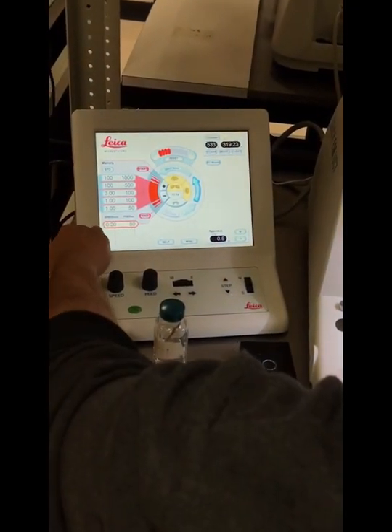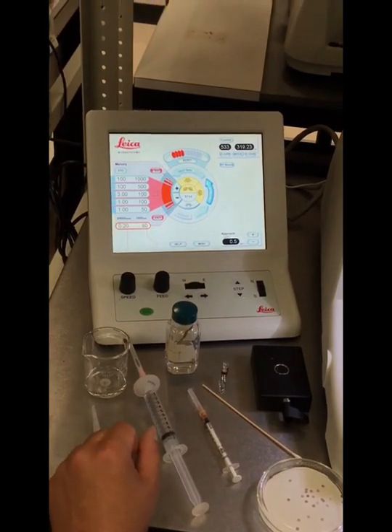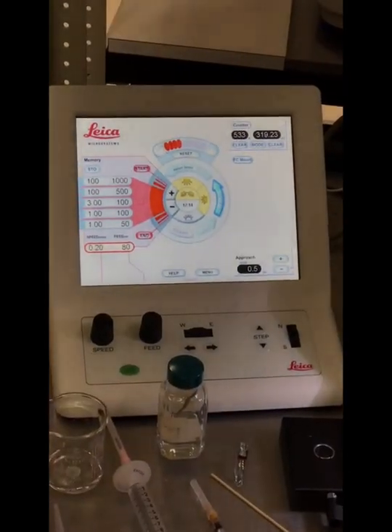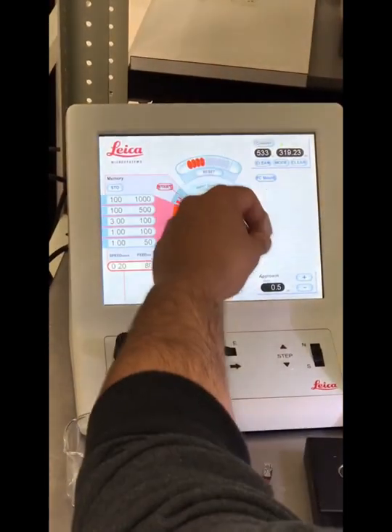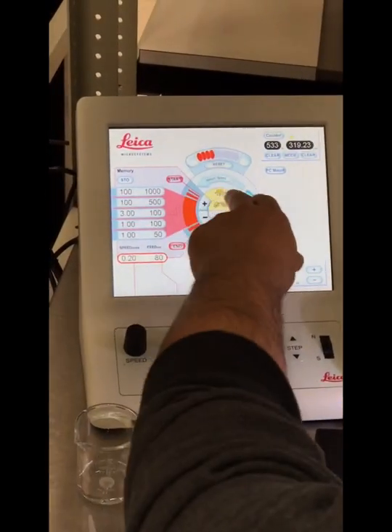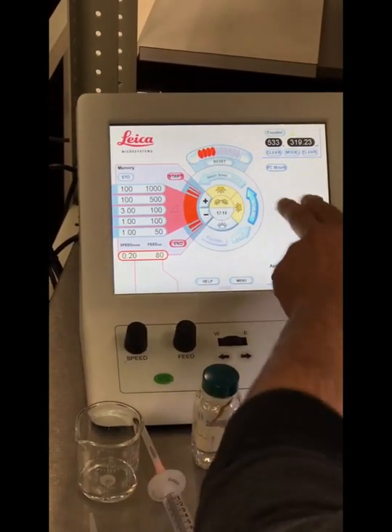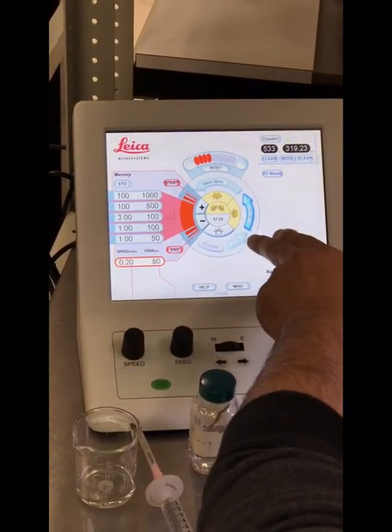This is the interface display that we'll be using, and I'm just going to go over a few things on the display so you're familiar with them. This is the counter window. The illumination settings are here. The return speed setting, medium, high, and low here.